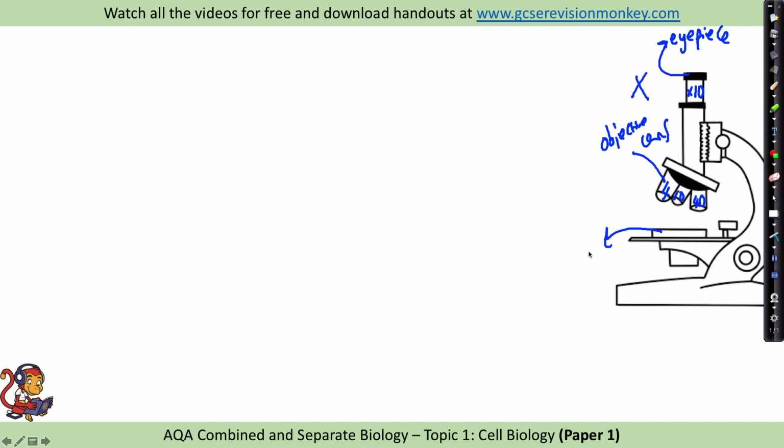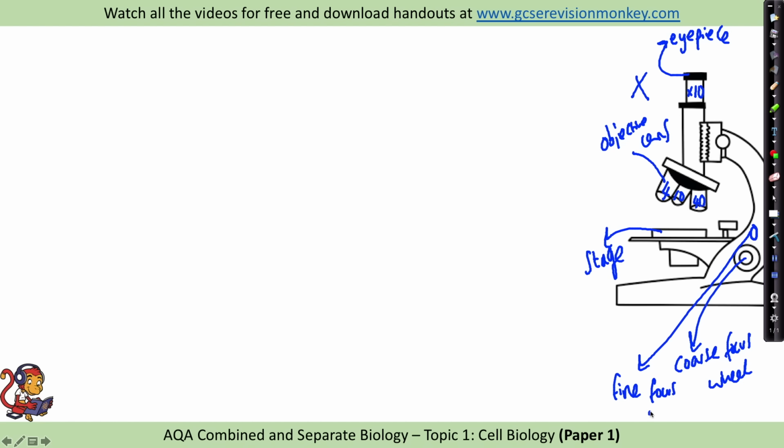This here is the stage where you put your slide that you want to view. And often on the arm here you might have 1 or perhaps 2 focusing wheels. The larger one will be for the coarse focus, so you can just call that a coarse focus wheel, and the other one would be for smaller adjustments, which is the fine focus wheel. So now I'm going to take you through the steps to carry out this required practical.